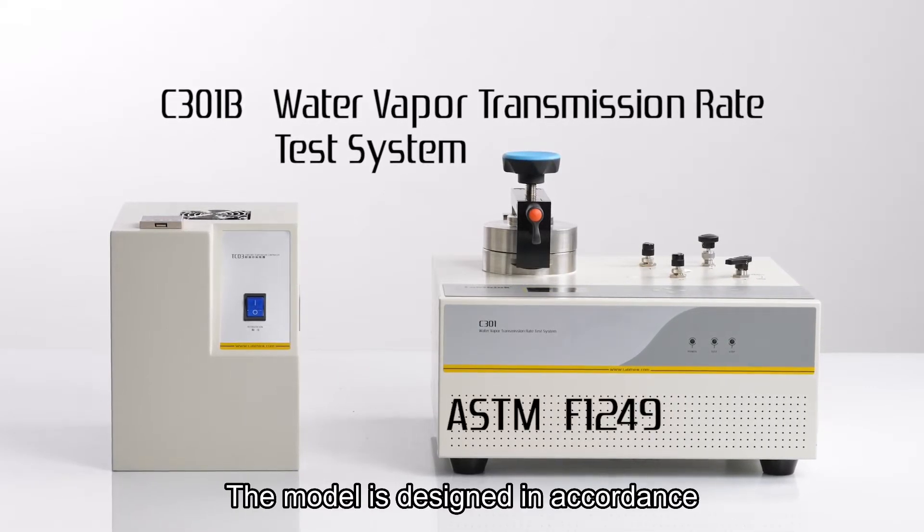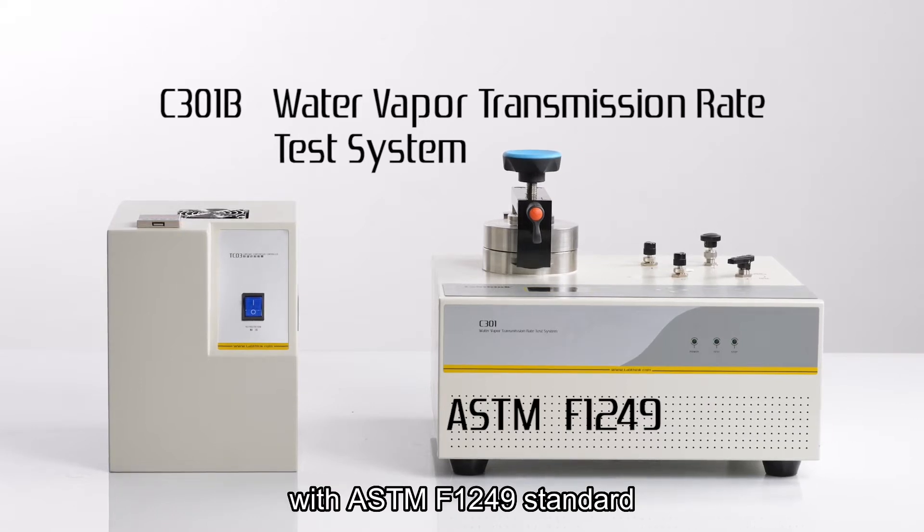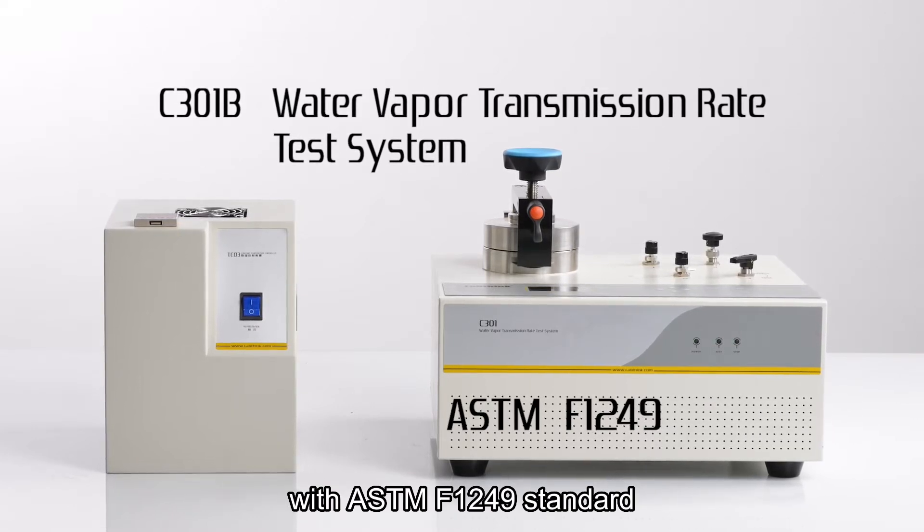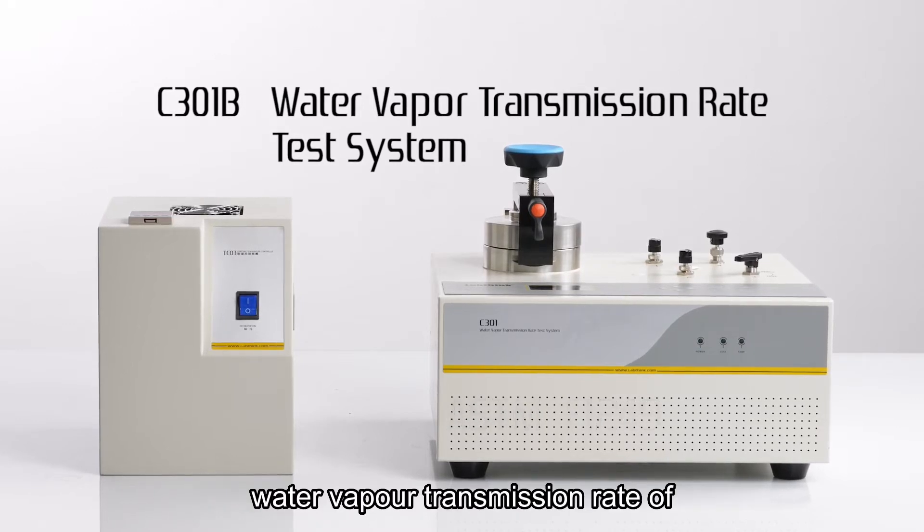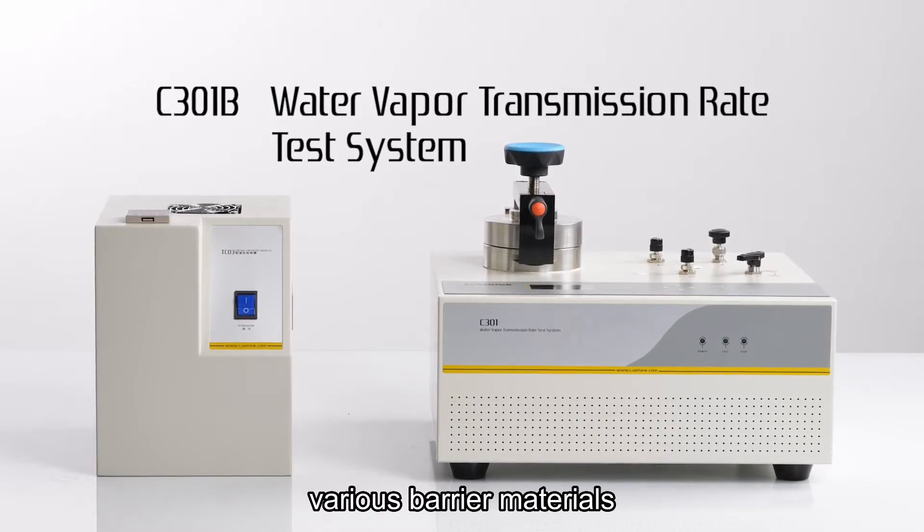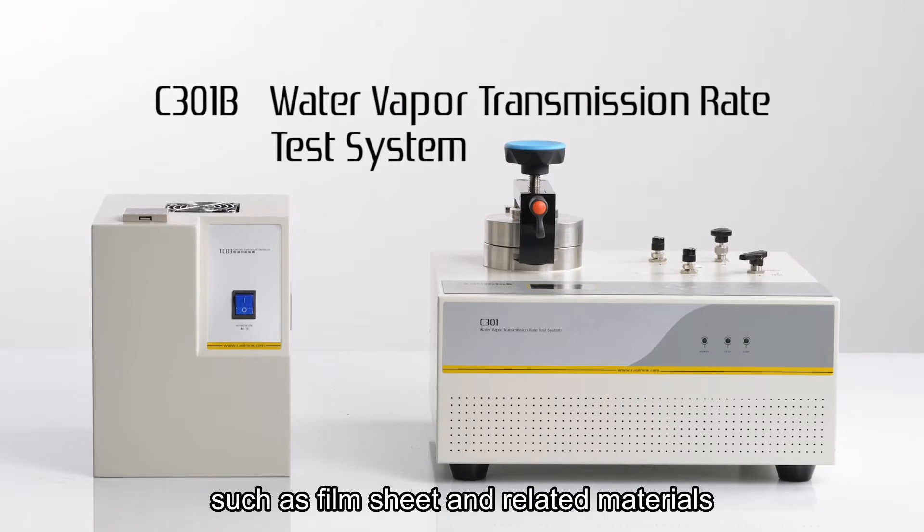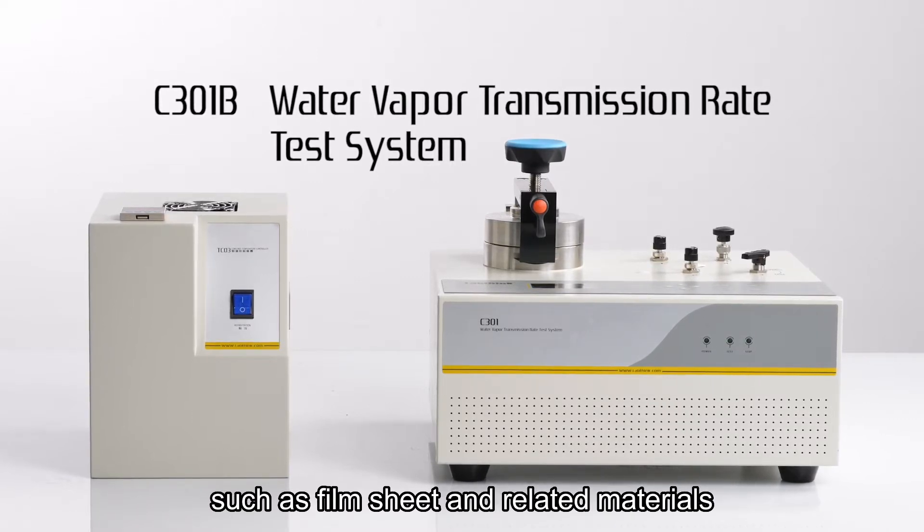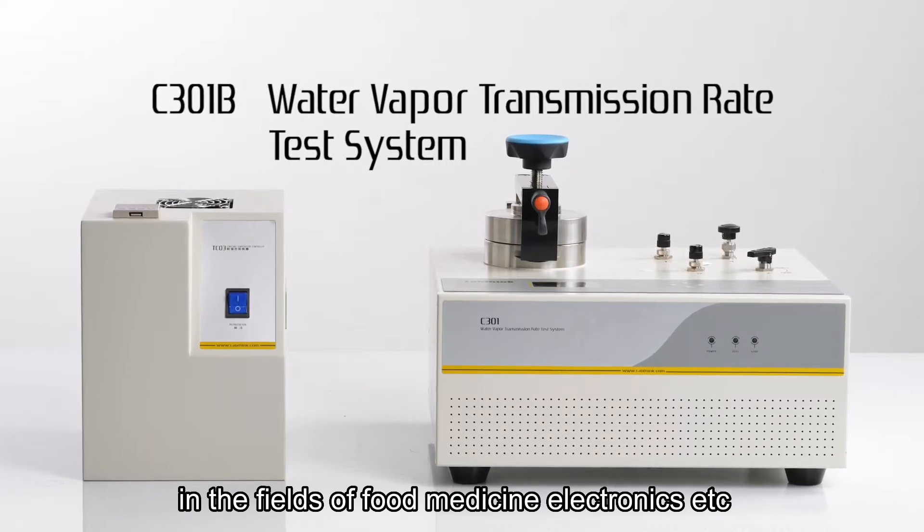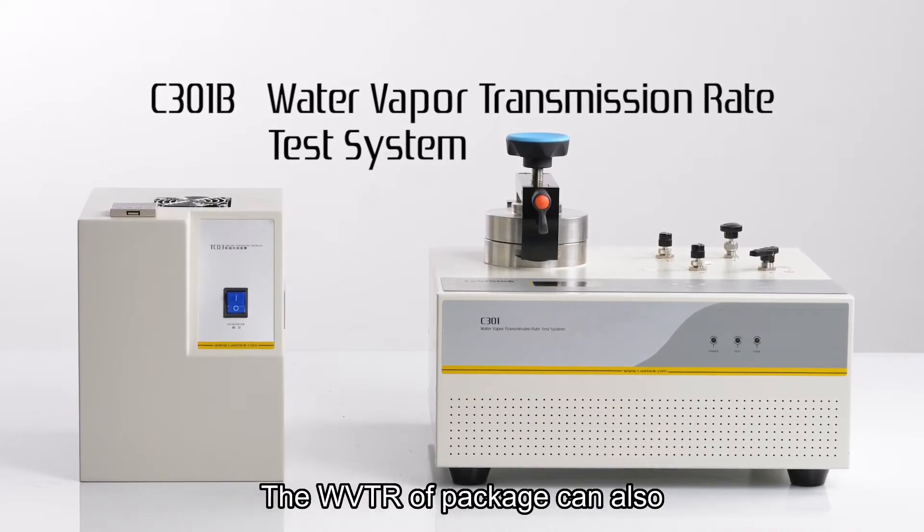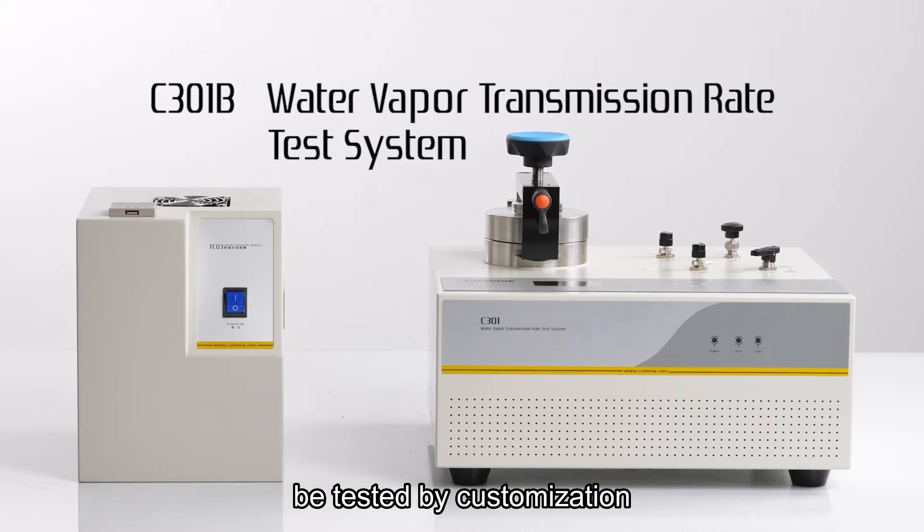The model is designed in accordance with ASTM F1249 standard. It is mainly applicable to the determination of water vapor transmission rate of various barrier materials, such as film, sheet, and related materials in the fields of food, medicine, electronics, etc. The WVTR of packages can also be tested by customization.